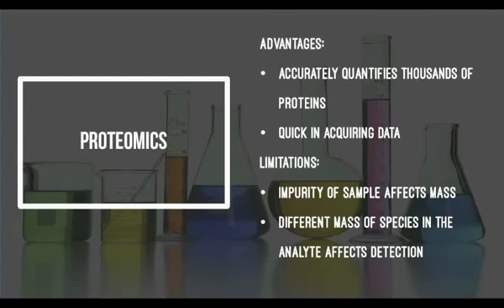As a side note, high throughput technologies refer to a range of experimental and computational tools to acquire experimental data. Furthermore, native mass spectrometry does not require large amounts of sample. A minimum of 10 picomoles is sufficient. Typically, 100 to 500 picomoles are desired to allow sample optimization and multiple analyses.